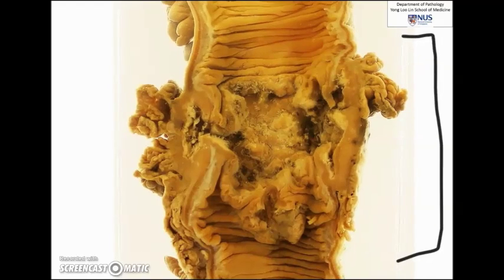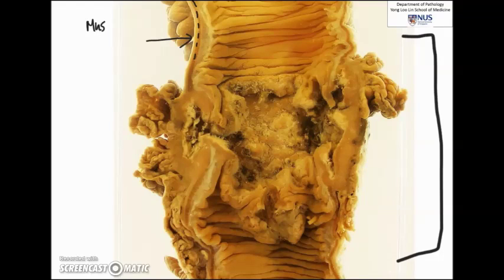Now when we zoom in, let us first recognize the most readily visible layer of the bowel wall. This brown line here is actually the muscularis propria. So it is important to actually recognize this grossly because when we are thinking about tumors, we can actually see how deeply it has penetrated.